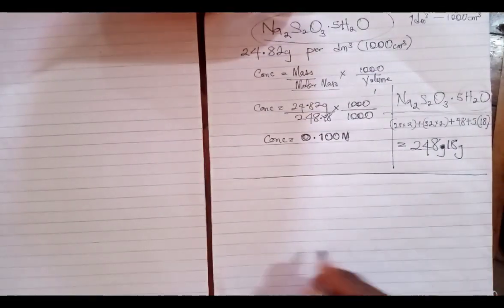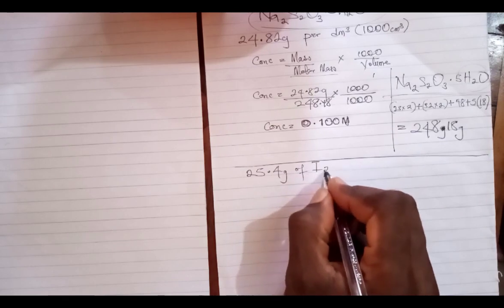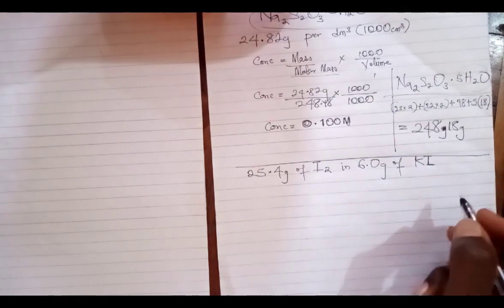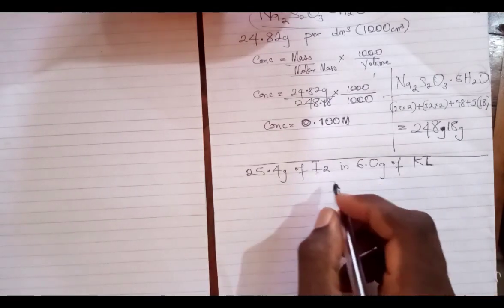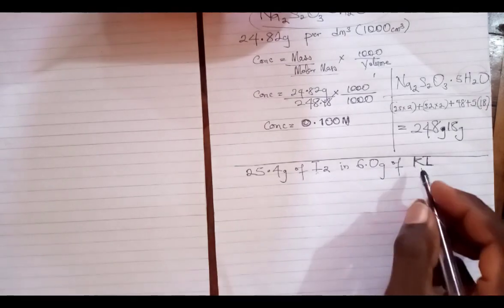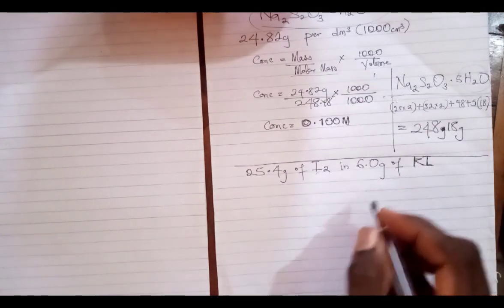Then we'll move over to iodine. It says dissolve 25.4 grams of iodine in 6.0 grams of potassium iodide. I told you, iodine is non-polar, and as a result cannot dissolve in water, and that's why we are adding potassium iodide to it. When you add potassium iodide to it, it gives you potassium triiodide, which is very soluble in water.